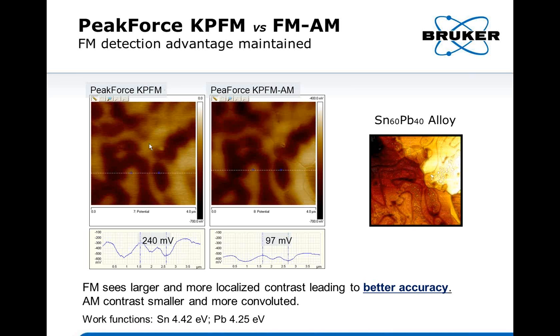So if you just look at the map, the left is the PeakForce KPFM FM, the right is the AM. Now, if you just look at the picture, you say, these two look very similar. The resolution is about the same. The real difference is really in the numbers.